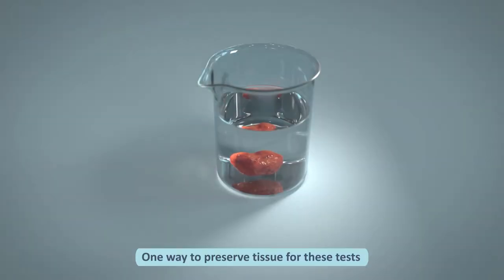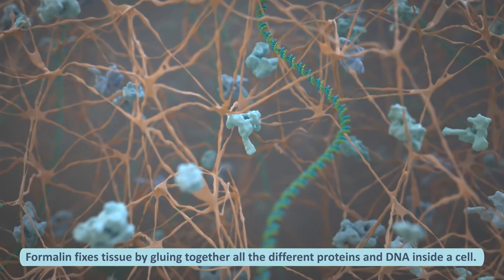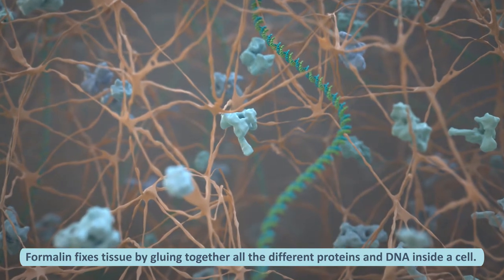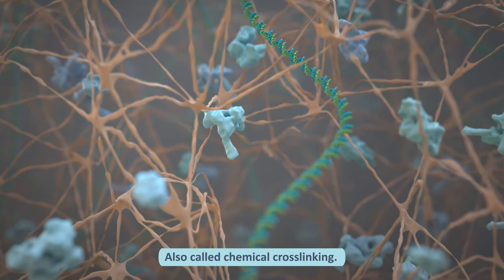One way to preserve tissue for these tests is to immerse it in a liquid called formalin, which is diluted formaldehyde. Formalin fixes tissue by gluing together all the different proteins and DNA inside a cell, also called chemical cross-linking.